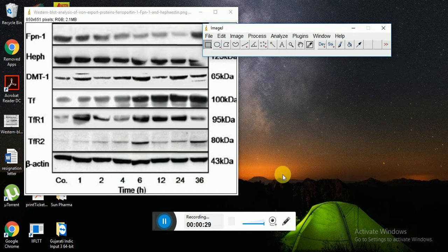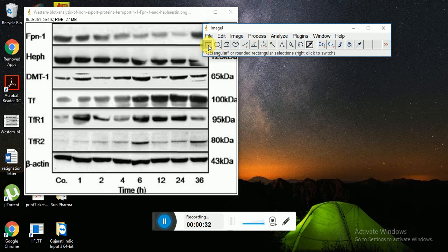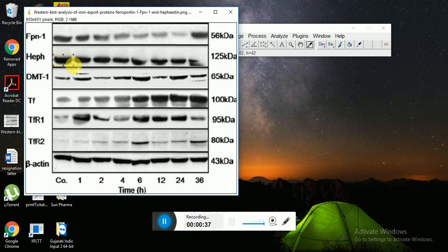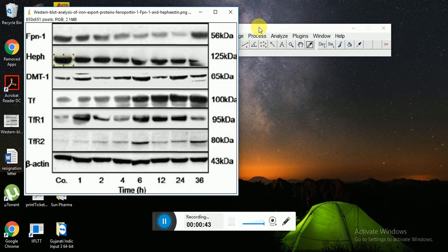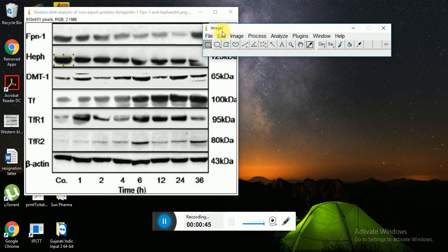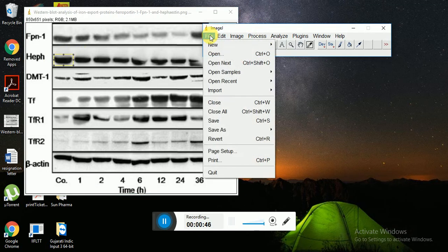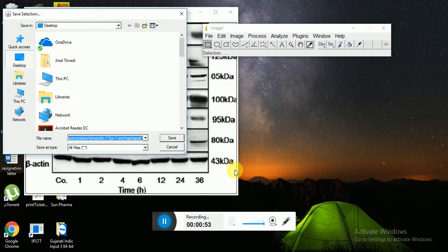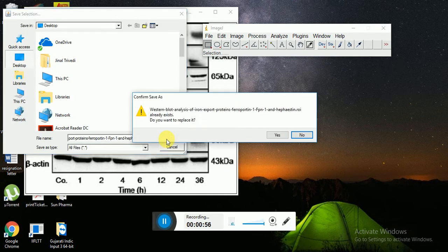Then first select a rectangular selection and make a simple uniform selection to your desired protein. Now first save the selection. For that go to save as and selection. You will be asked to save that selection area. You can save it.